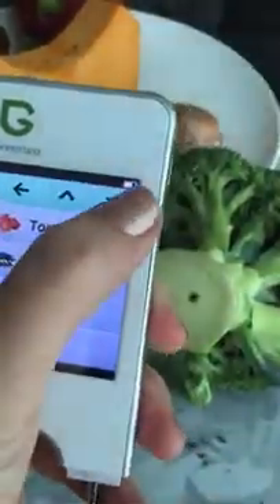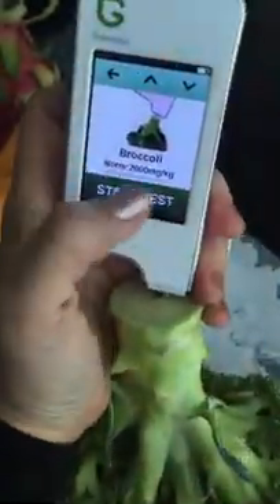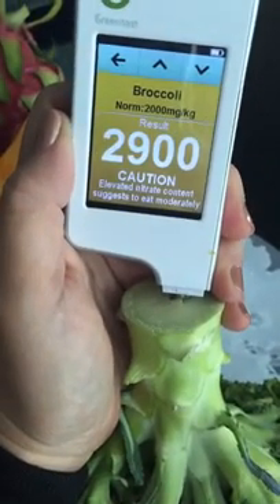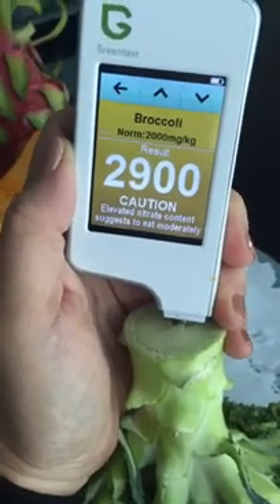Let's do all the vegetables in this video and maybe do one for fruit later, perhaps tomorrow. Let's go broccoli — there we go, broccoli selected. Oh, non-organic broccoli is a no-go. This is amber — elevated nitrate content — so eat moderately.